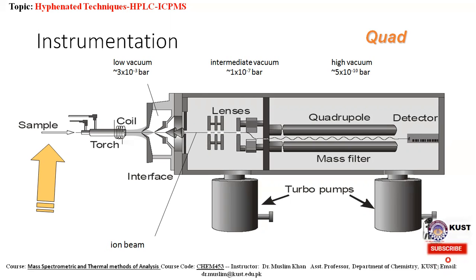This has the effect of ionizing the gas, and when seeded with a source of electrons from a high voltage spark, forms a very high temperature plasma discharge, around 10,000 Kelvin, at the open end of the tube. This is where the similarity ends in comparison to ICP-OES.